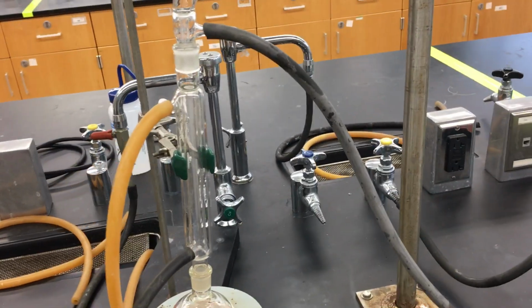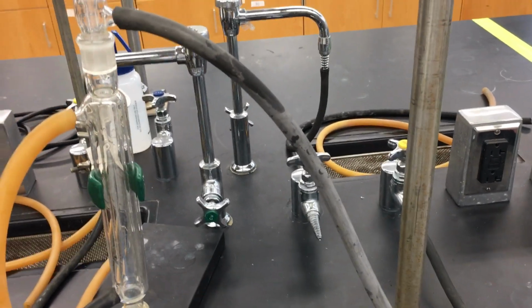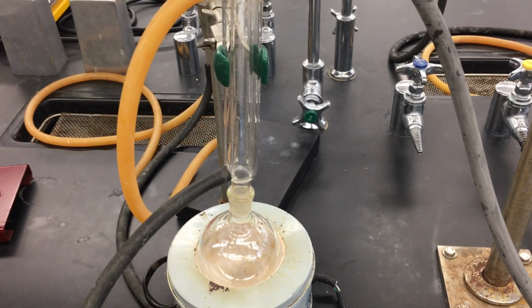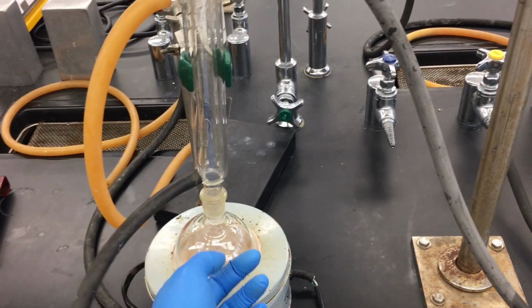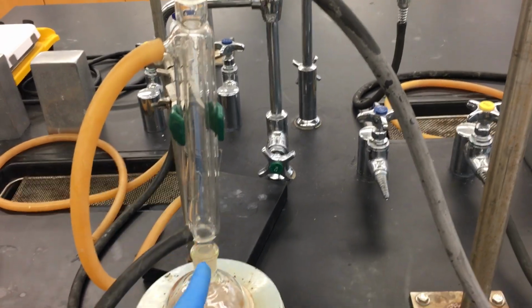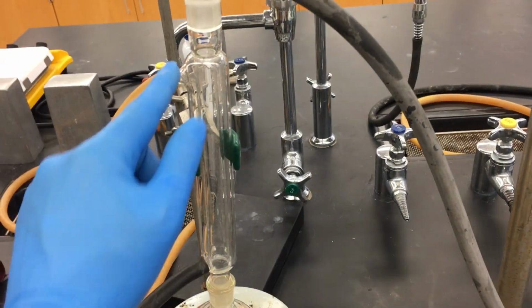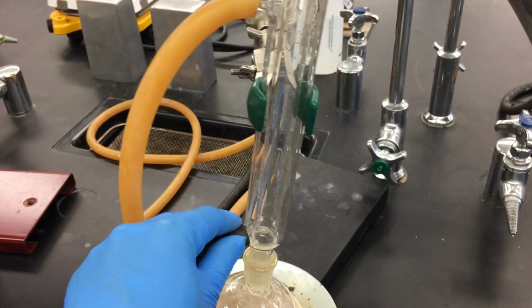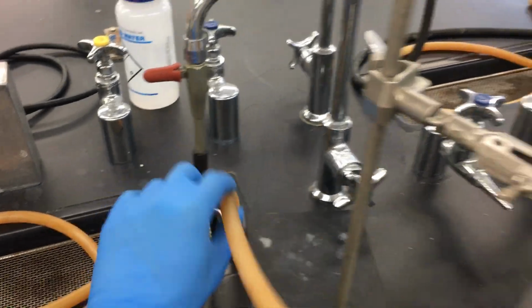In the case of organic refluxing, we have a pot or a reaction flask in which we boil our solvent up to the boiling temperature of that solvent. And the solvent has all our reaction components dissolved in it. Then it's attached to a condenser here, which is also connected to water inlet as well as water outlet hoses. Water flows through this black hose inside the condenser on the bottom, and it exits from the top back out into the drain through this yellow hose.